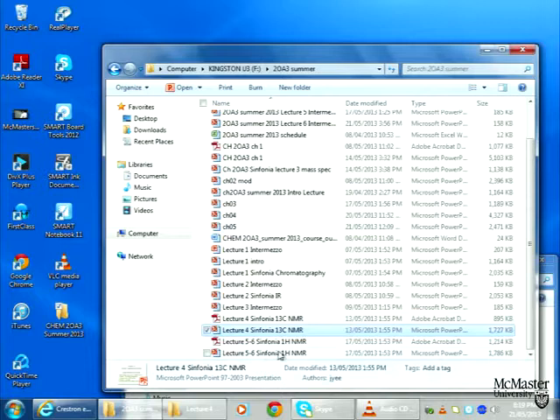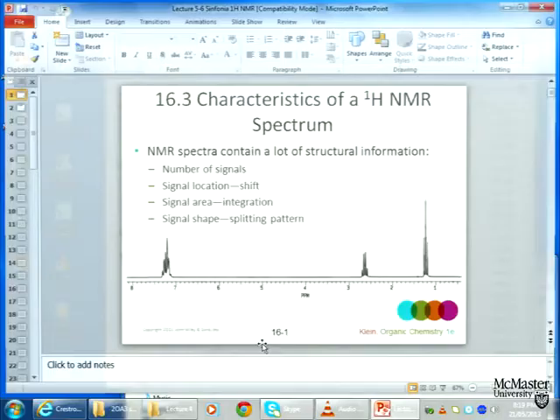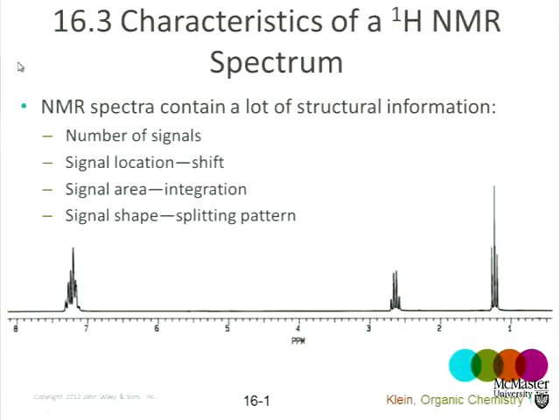And so now we can go to proton NMR. And I've left this to last, even though, in fact, in the early days, proton NMR was the technique that was used, and NMR spectrometers were simply too insensitive to pick up that small percentage, that 1.1% of carbon-13 in organic compounds. Nowadays, however, it's easier to understand carbon NMR first, and then to work your way towards proton NMR.